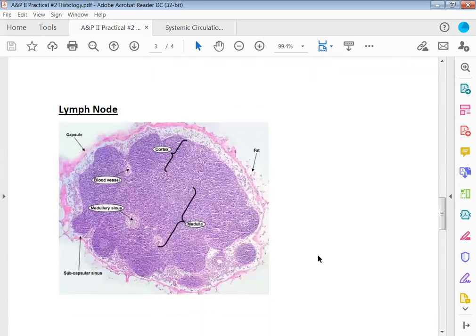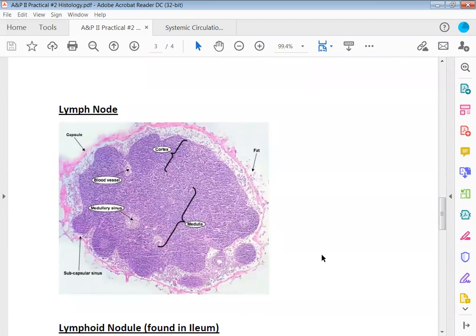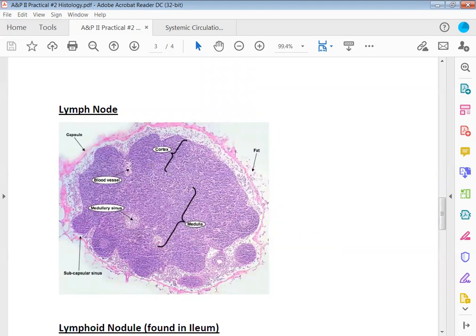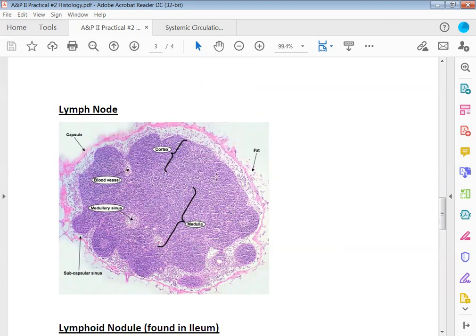Then going down to the lymph node. If you remember in the adrenal gland you had the capsule, then you had the cortex, then you had the medulla. You have the same levels of organization here. You have the capsule on the outside, that's like the skin around the lymph node. Then the first layer underneath the skin is the cortex, it's the outer layer. And then the middle layer here is the medulla.